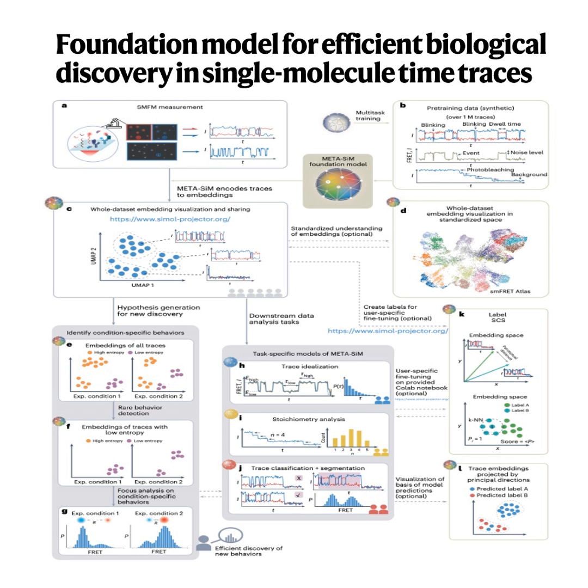Okay, but how do you teach a machine the general nature of a wiggly line representing a molecule's behavior? That seems abstract. It uses a technique that became really famous in natural language processing, actually. The attention mechanism. Attention, like paying attention? Sort of, yeah. Instead of just processing the time trace step by step, frame by frame, the model looks at the entire trace all at once. It breaks the trace down into little segments, like trace patches.